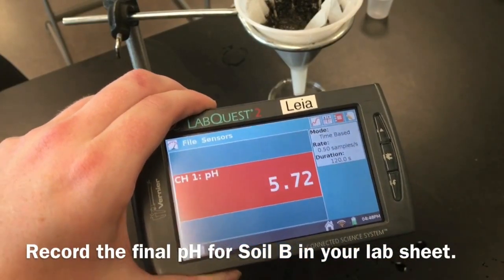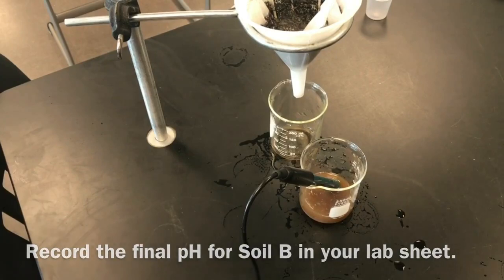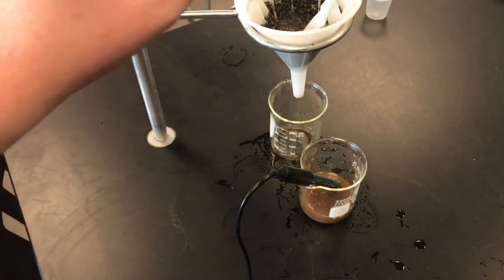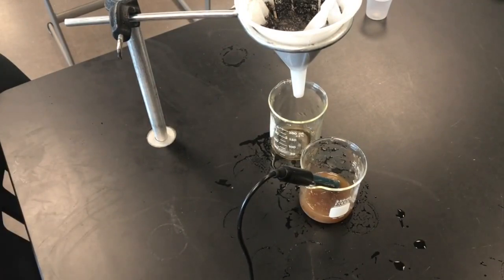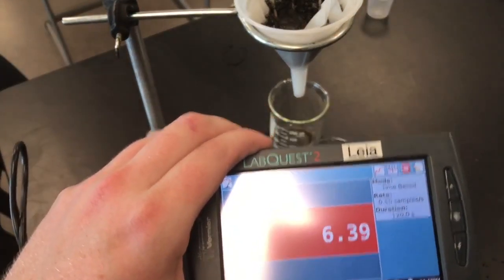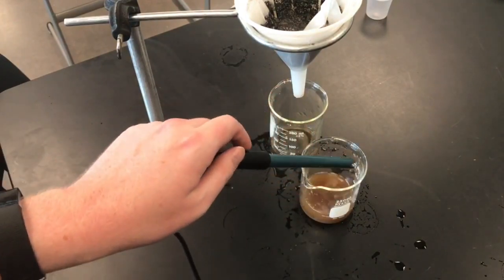Wow, all right, looks like it did kind of what we thought it would do and buffered for a lot of that acidity. So we ran acid through soil A and soil B, and our value for pH was a lot higher in soil B. So I'm just going to take that out.